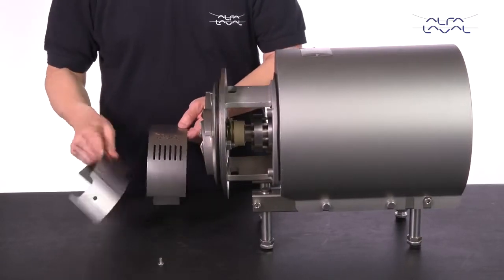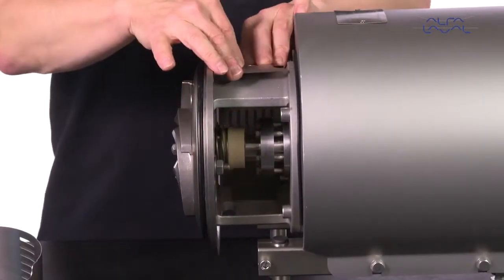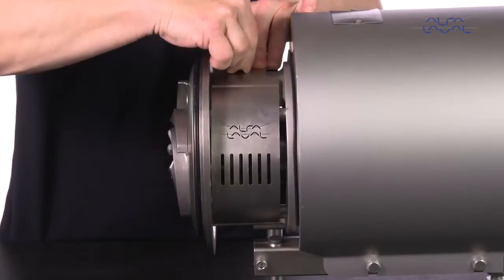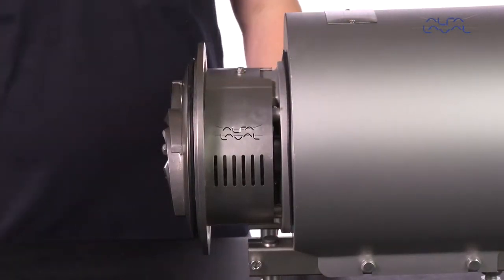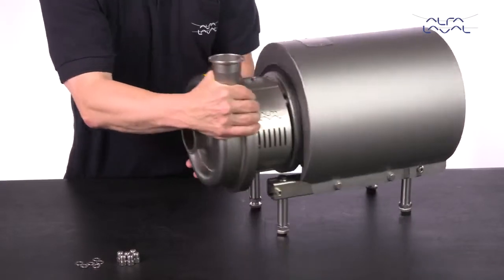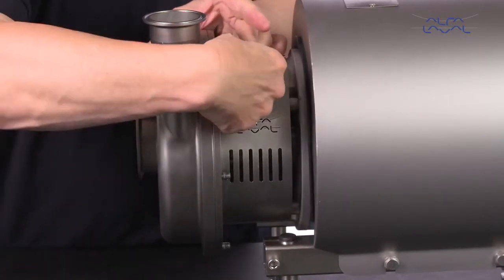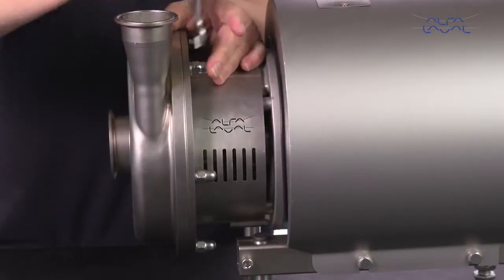Fit the safety guards and then screw and tighten them. Fit the pump casing, washers and cap nuts. Tighten the cap nuts according to the torque values in the instruction manual.